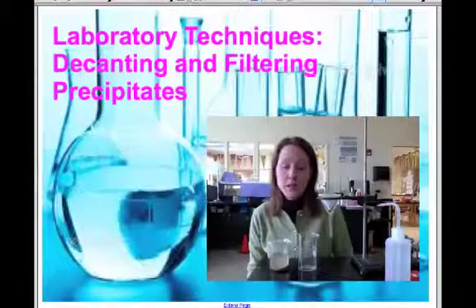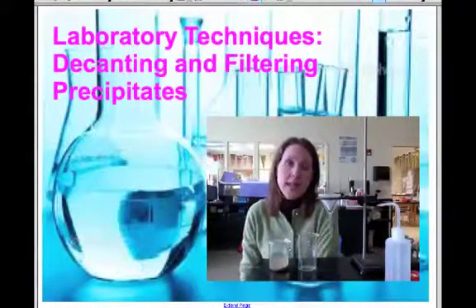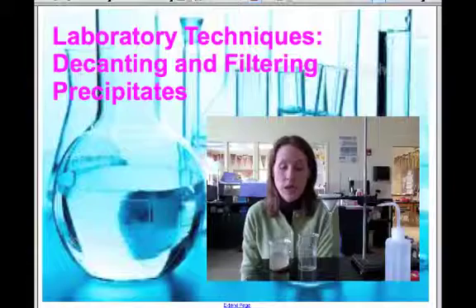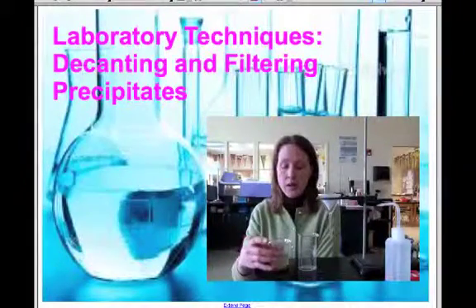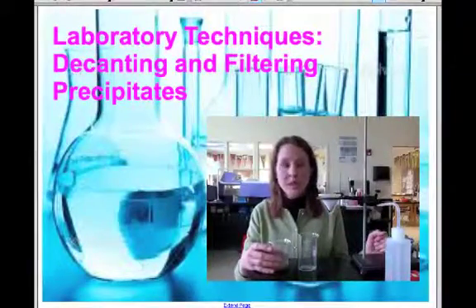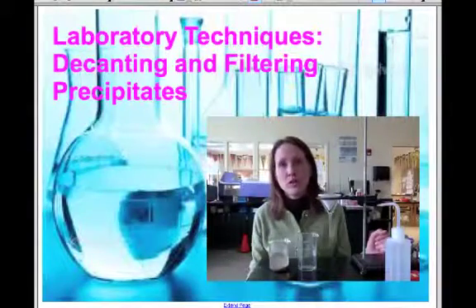Hi, I am going to demonstrate to you how to decant. Decant is just a term that means separating parts of a mixture. And I'm going to demonstrate how we are going to separate precipitate from a liquid. When you do your experiment, you will be actually separating out some very beautiful silver crystals.